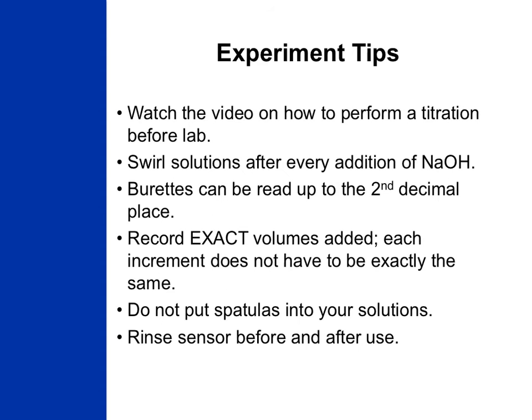Please watch the video under Techniques on the course details site that explains how to set up the apparatus and perform a titration. It will help you get a better idea of how all the equipment is connected together and will walk you through the steps needed to set up the measurement station that are also explained in Chapter 4 of your lab manual.